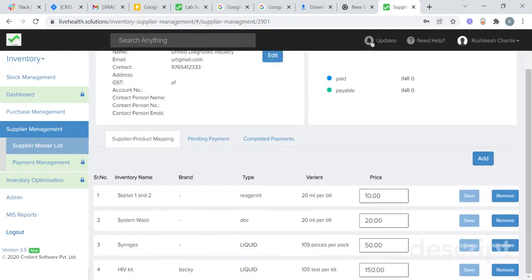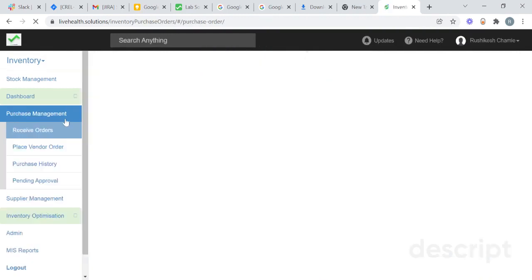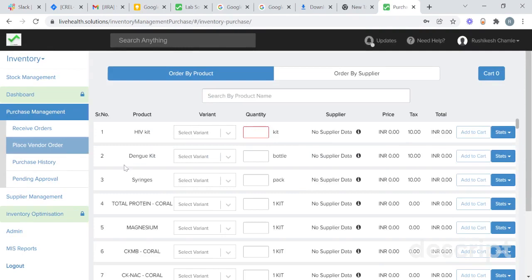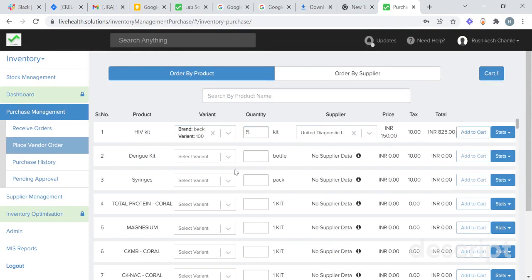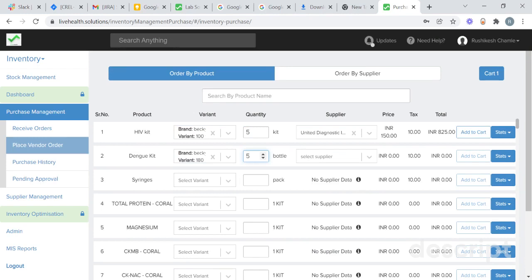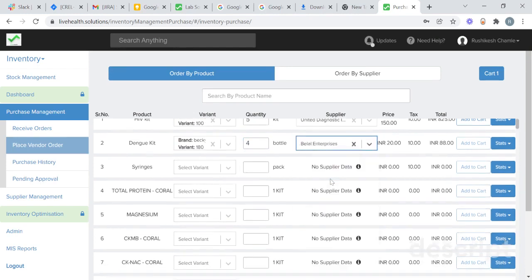To purchase stock from a supplier, go to purchase management and go to place vendor order. This e-commerce UI will be very convenient for you to place a vendor order. Select the quantity you want to buy — suppose I want to buy five kits of HIV kit. Select the supplier you want to buy from; the price will be automatically calculated and shown as the total value. Click on add to cart. You can also add multiple products at the same time — suppose I want to buy a dengue kit. Select the quantity, select the supplier, and click on add to cart. If you want to buy a product from a separate supplier, go to order by supplier.